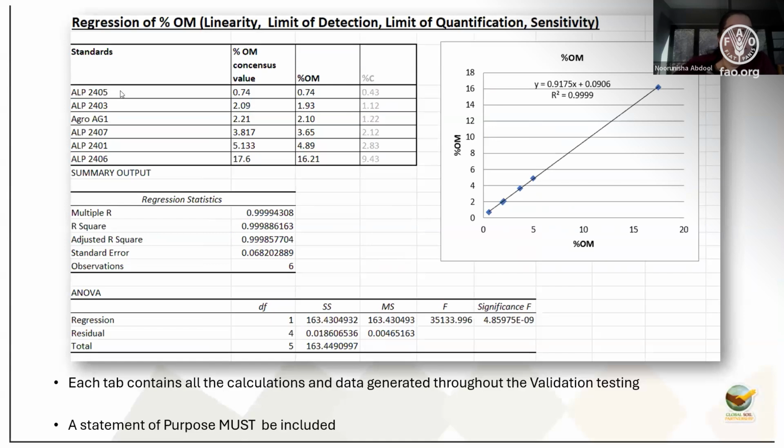So what we are going to do is you are going to have your data, and I hope everyone can still see my screen. You're going to have your raw data and you're going to make, basically this is an XY scatter to show that you are linear. You're going to use ANOVA if you use your Excel. And you don't have to be an Excel boffin, and you certainly don't have to be a stats boffin to be able to do this. ANOVA is built into your Excel.